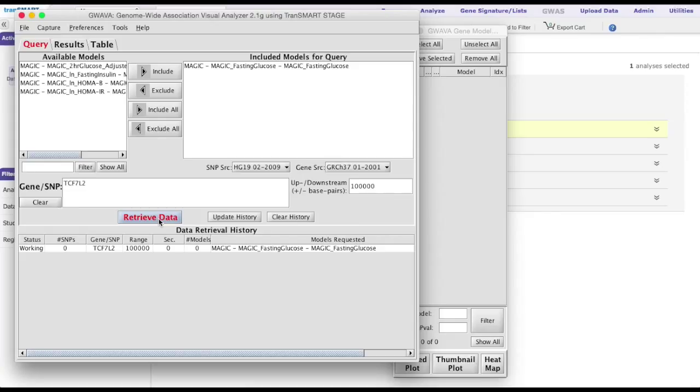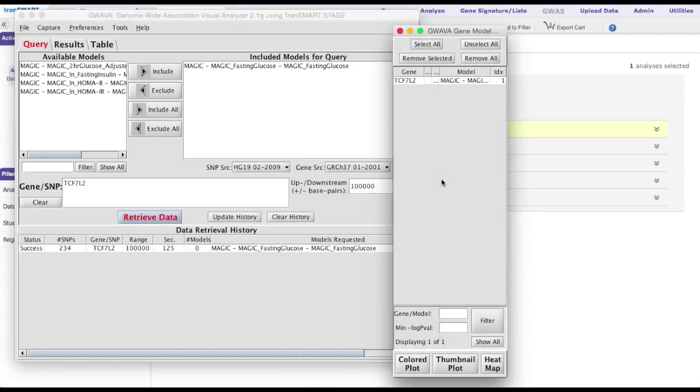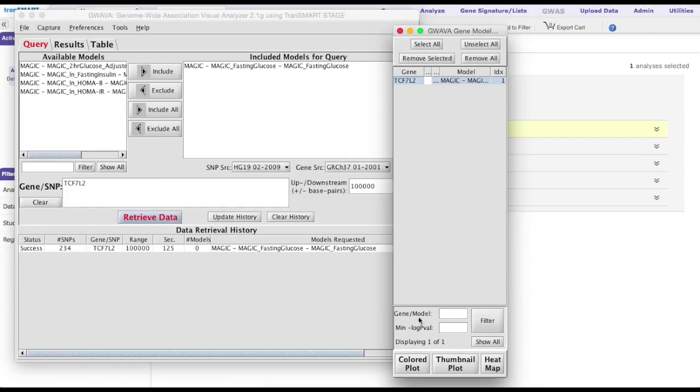Once the status is changed from working to success, the guava gene model selection window will populate a list of the genes of interest. Selecting on one of the genes and clicking on the colored plot will display the Manhattan plot.